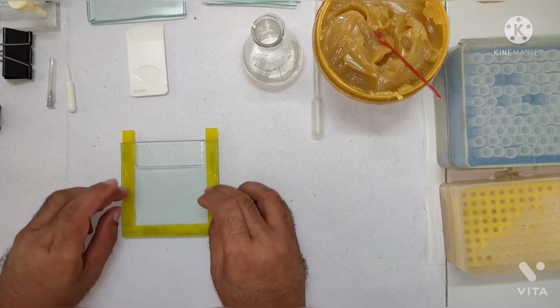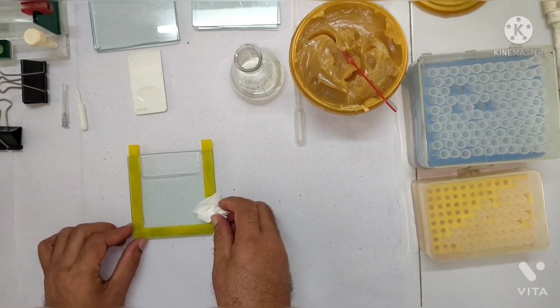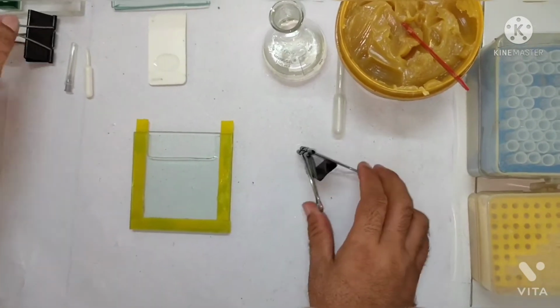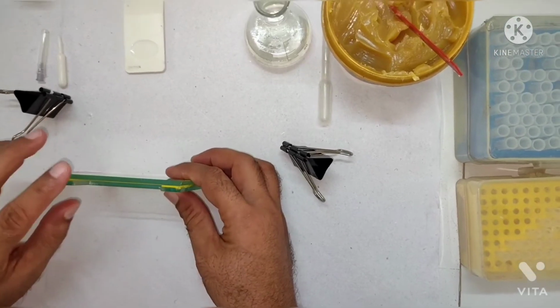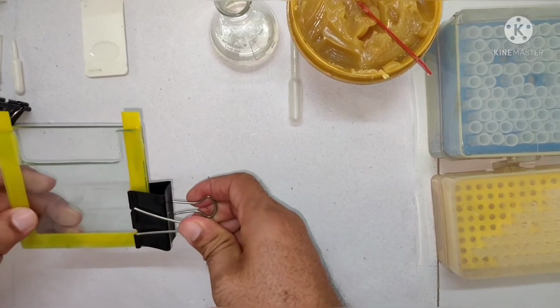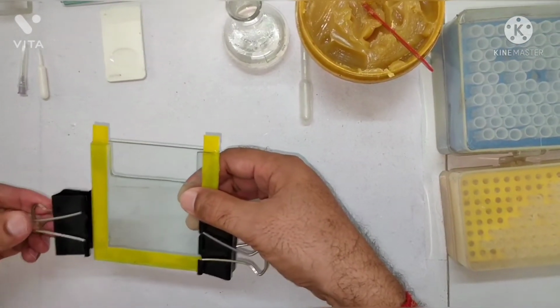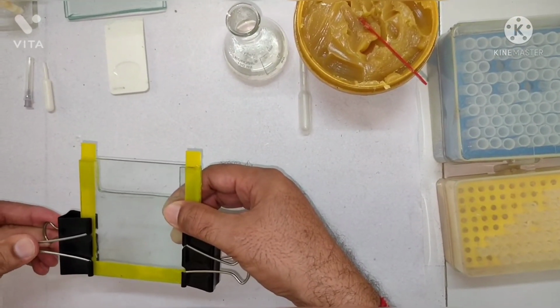And now you put this notched plate over here, okay. So we put notched plate here, fix them well, right? Just you press them, okay, all right. And what you do after that, just you take these clips, these are the simple clips, right? You can get these clips at the stationery store, okay, or scientific store, and you put these clips here like this, okay, so that it will be fixed well. So both plates are now fixed well, okay.